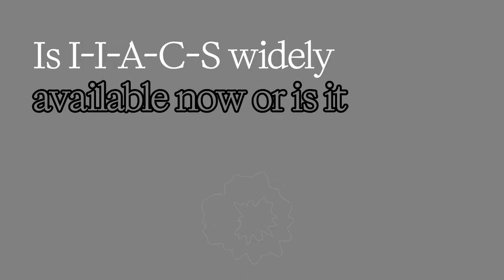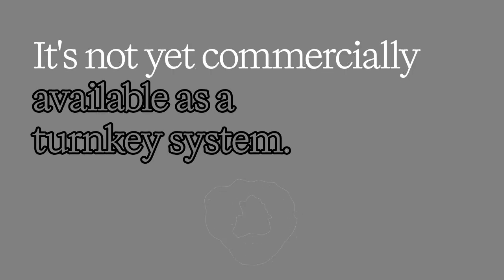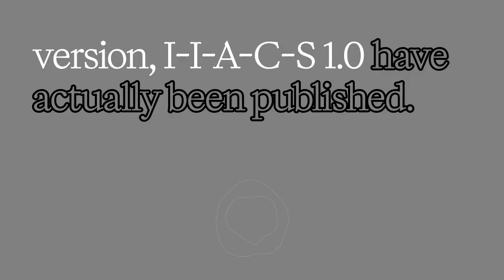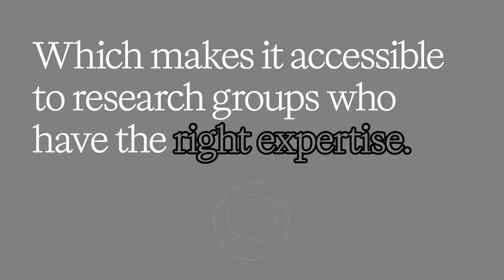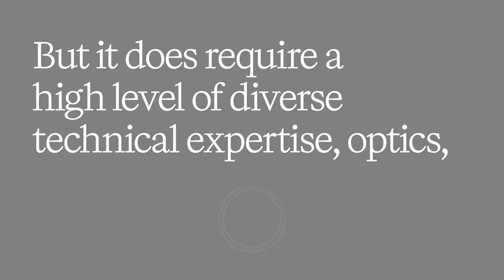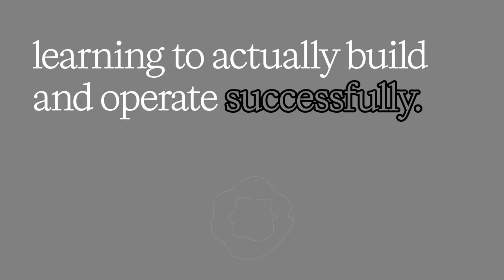Okay. Is IACS widely available now, or is it more of a specialized research tool? It's not yet commercially available as a turnkey system. However, construction protocols for the original version, IACS 1.0, have actually been published, which makes it accessible to research groups who have the right expertise. So you could build one yourself if you have the skills. Essentially, yes. But it does require a high level of diverse technical expertise, optics, microfluidics, electronics, software, machine learning, to actually build and operate successfully.